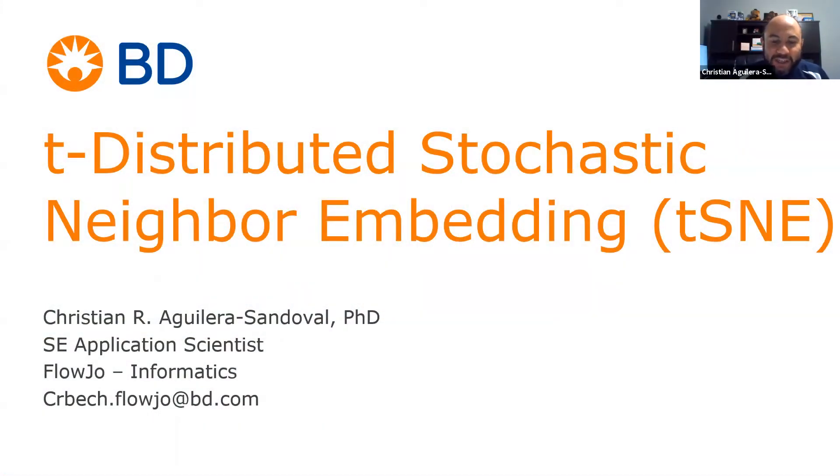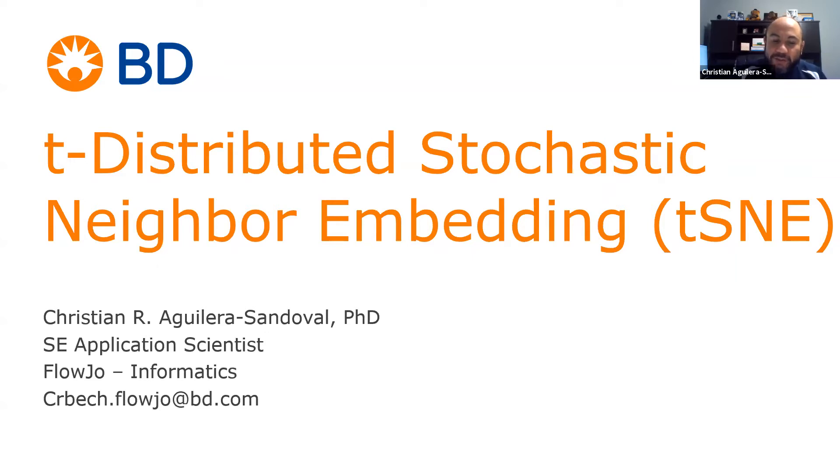Hello, I'm Christian Aguilera-Sandoval, your FlowJo application scientist. Today I'm going to show you how to use t-SNE in FlowJo v10.